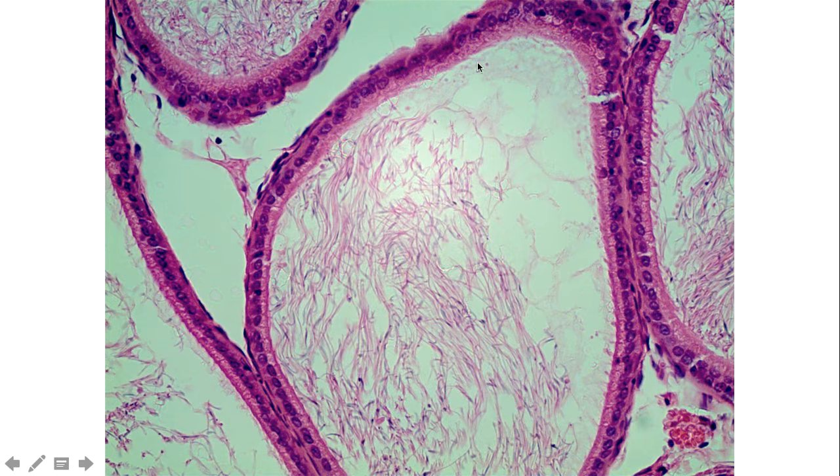And these are not here to move the fluid through. They're actually here to add surface area for absorption of the luminal fluid as well as secretion of nutrients to help nourish and support these developing sperm. So you'll notice the wall is very different when you compare this tube, the duct of the epididymis, with the seminiferous tubules that you'll see within the testis itself.